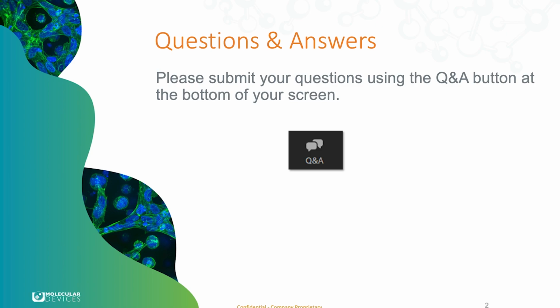Yeah, thank you very much for those questions. A really good question, and this is absolutely possible. During validation, we did run up to 10 experiments simultaneously on the system, and we used 4 different model systems in parallel. Yeah, absolutely. This is something we can do.